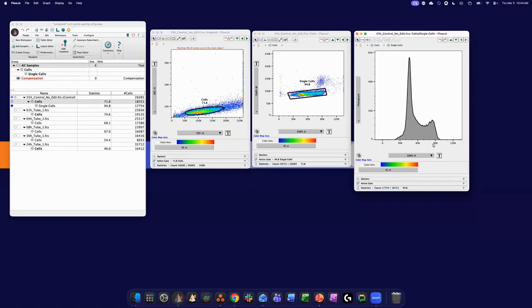My guess is that we would start to see some differences in the DNA content. So instead of a 2N here, we'd see maybe a third peak of a 3N, 4N, 16N, and so forth. So polyploidy can start to get tricky. I would imagine your cleanup gates might be similar because when we're looking at things like area width, area height, those have to do with how long it took a cell to pass through an interrogation point and not necessarily how much DNA content it has.